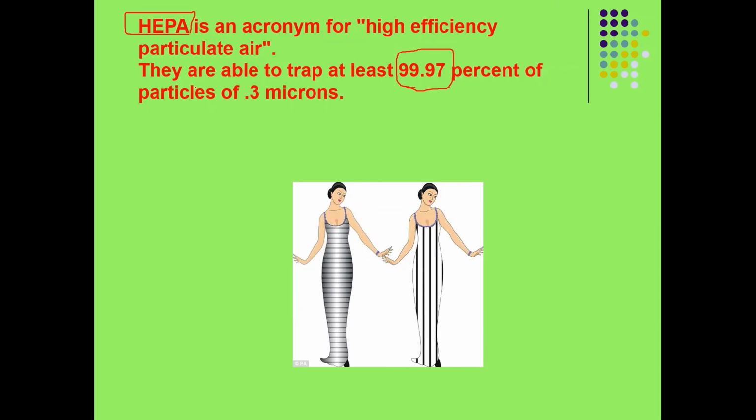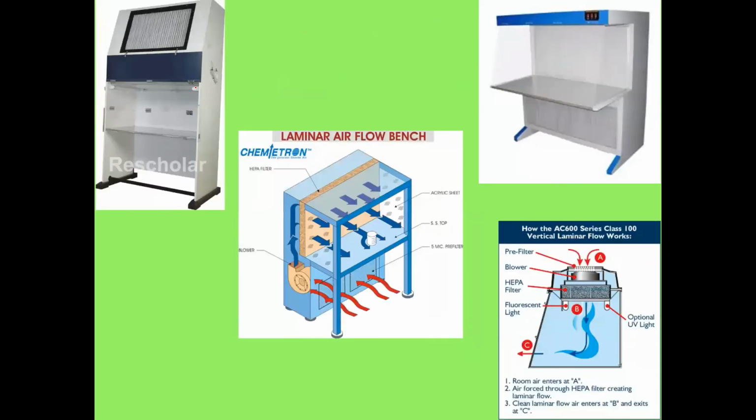And these young ladies here are just to represent, for example, the vertical and horizontal hoods. Here you are seeing horizontal, where you have air flowing directly onto your face. In this case, this is a vertical, where the air is produced from the top, falls on the floor and then turns up to your face when you're working. I personally have some psychological problem with this, and I will share this because I never liked this one. I don't know why.